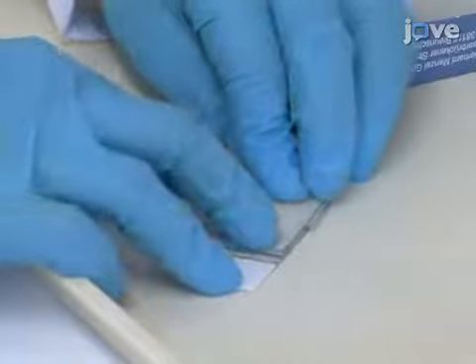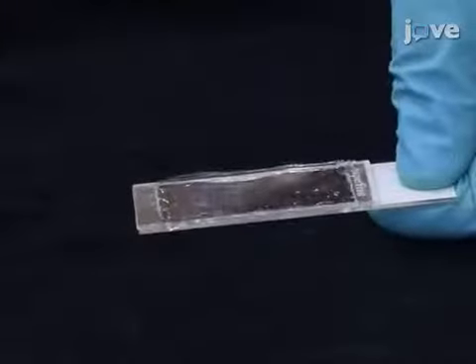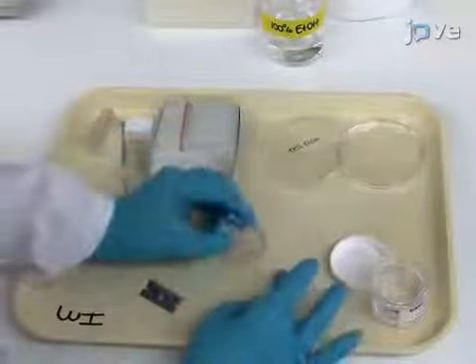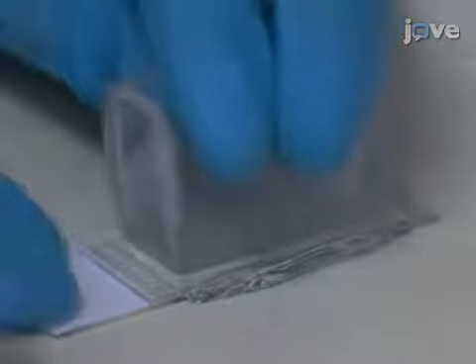Then, re-flatten the PDMS down to the height of the strip. Then, cut a cavity into the PDMS that will hold the seedling and agar slab.